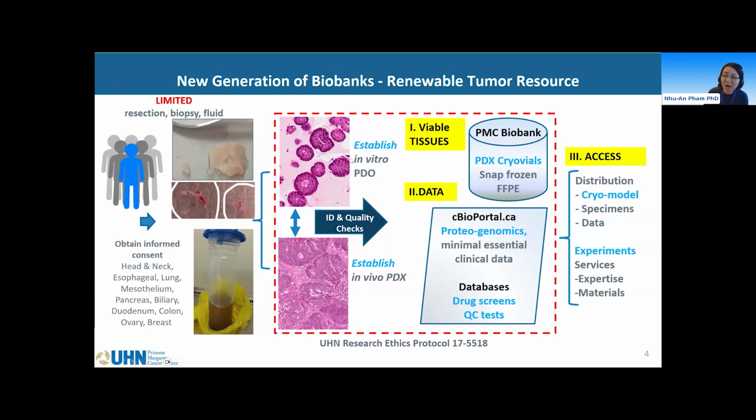So the Living Biobank itself, between Nikki and myself, we also initiate studies to optimize methodologies for integrative use of the PDX and PDO programs. These methodologies are highly specialized, resource intensive, and time consuming to generate renewable in vitro and in vivo models, which we hope would maintain the high fidelity to their parent tumors. And so far, accumulating evidence shows potentially high clinical utility.